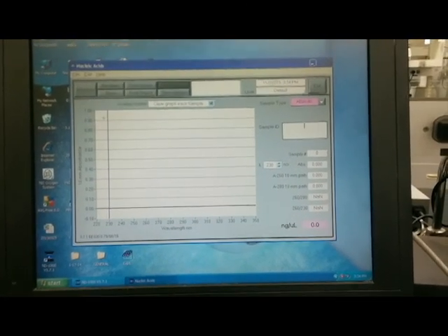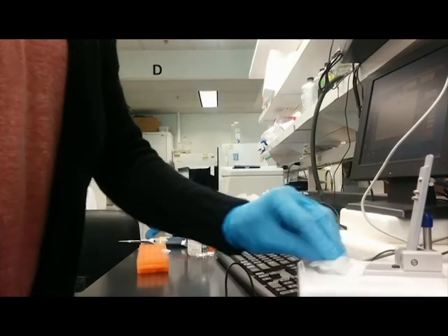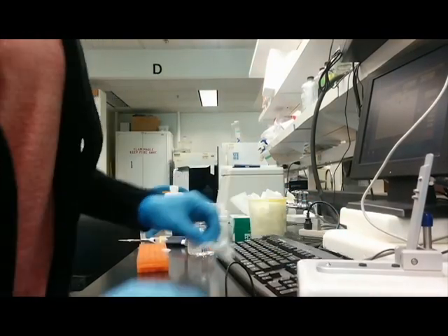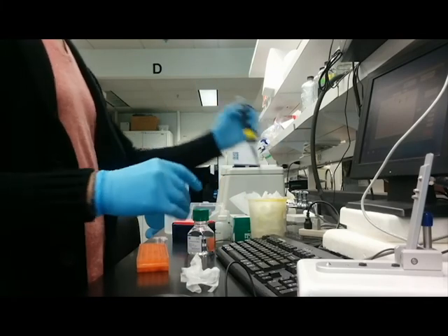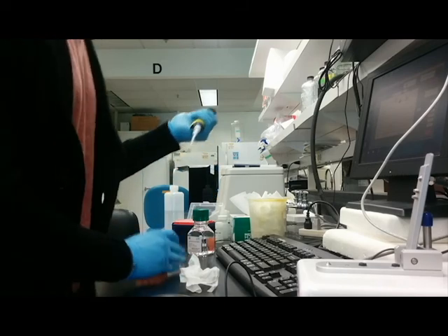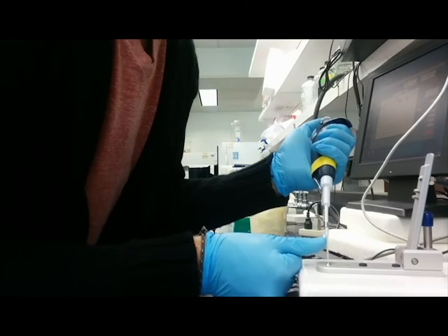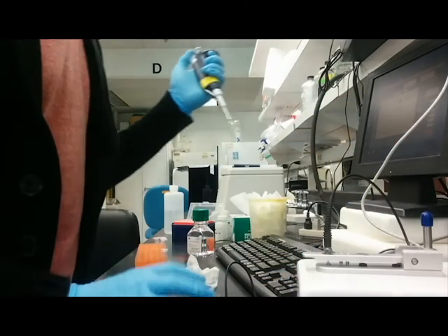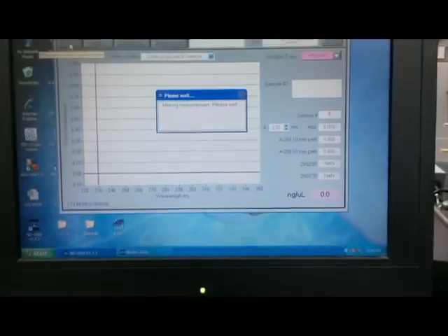Now we're ready to rock. We just add one microliter of our sample to the pedestal. Remove the water sample with a KimWipe, then flick the RNA sample a little so it mixes. Put it on the pedestal, close it, and measure it. It's going to spit out where the absorbance is.